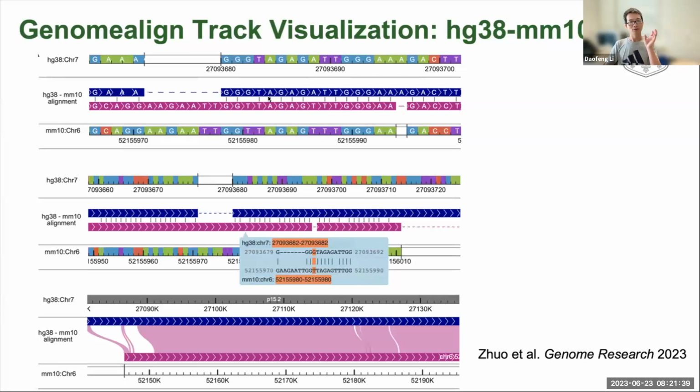If you continue to zoom out, when one pixel is not enough to represent one base pair on the screen, we show similar settings, but we no longer show the ATCG bases. But when you mouse over the region, you can see the alignment of the nearby few bases.